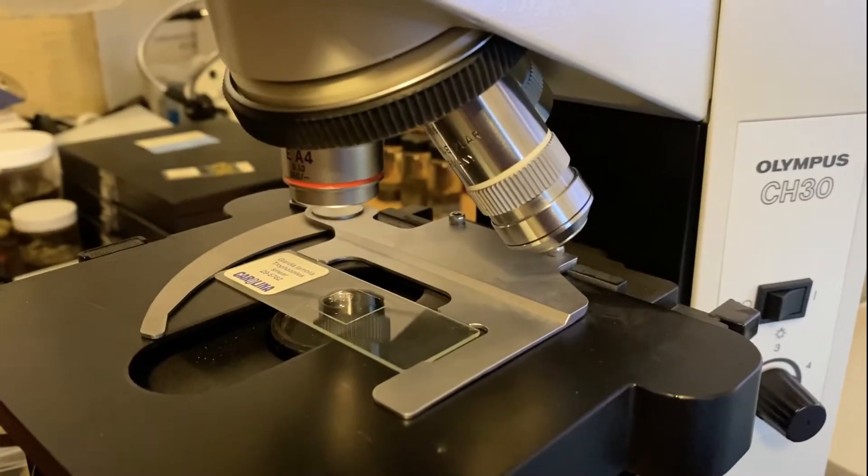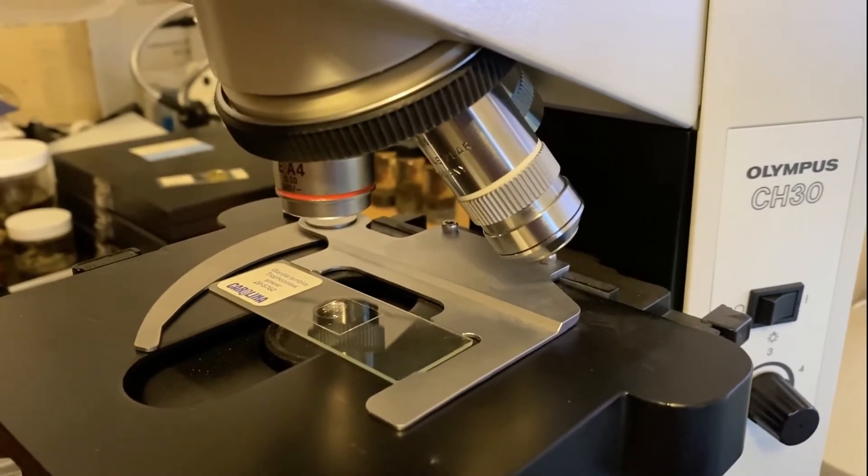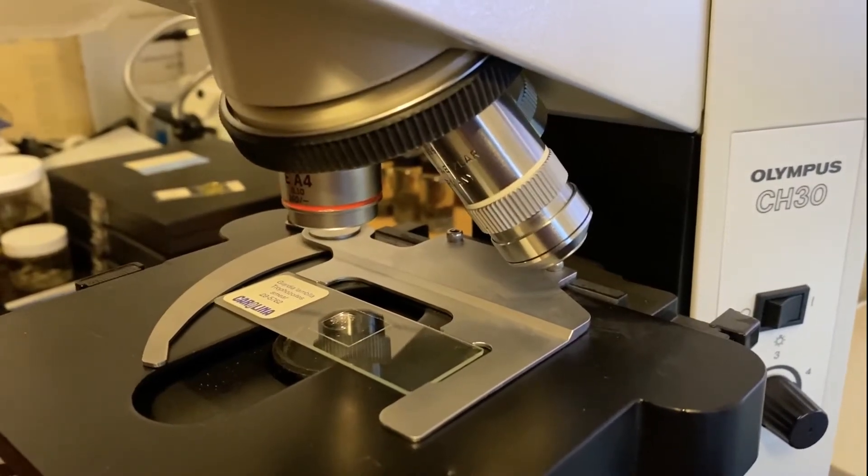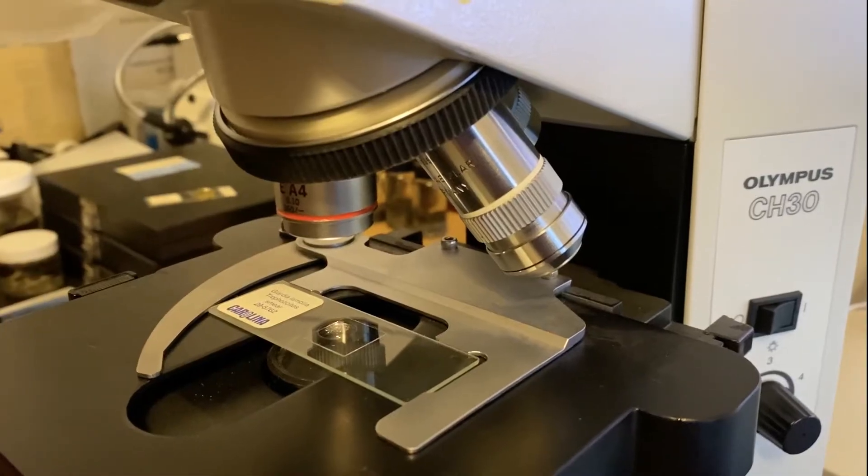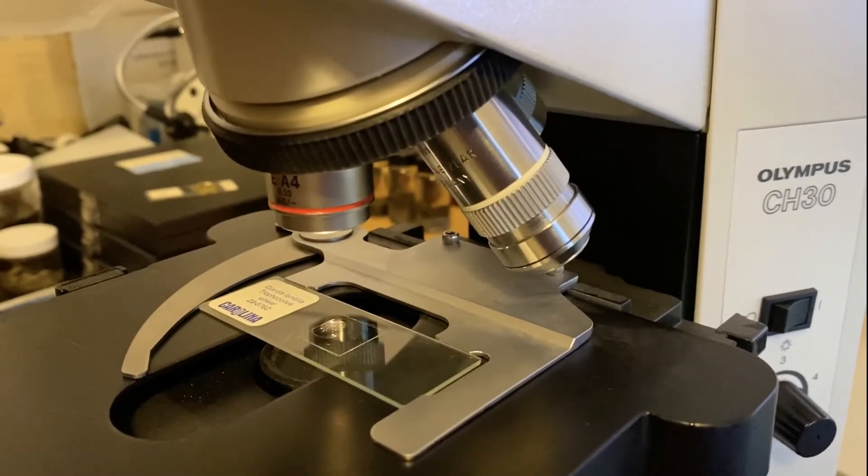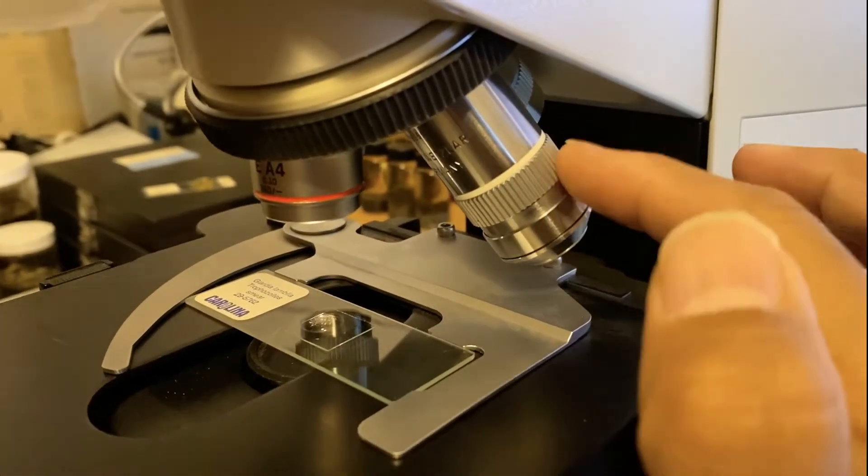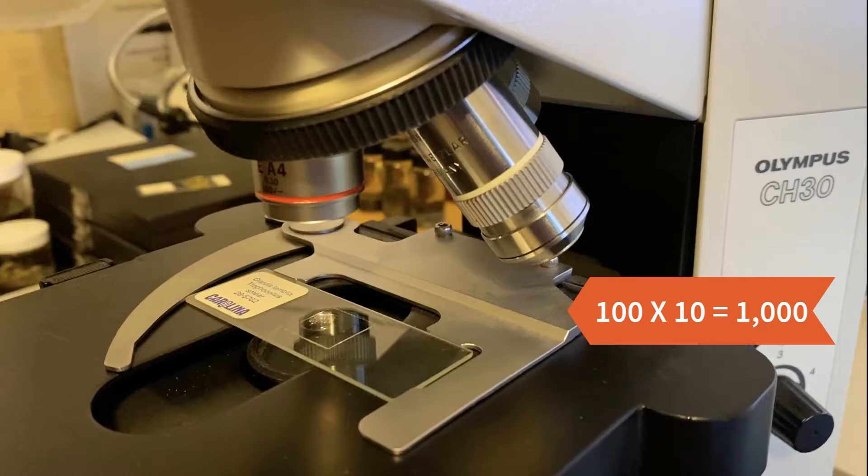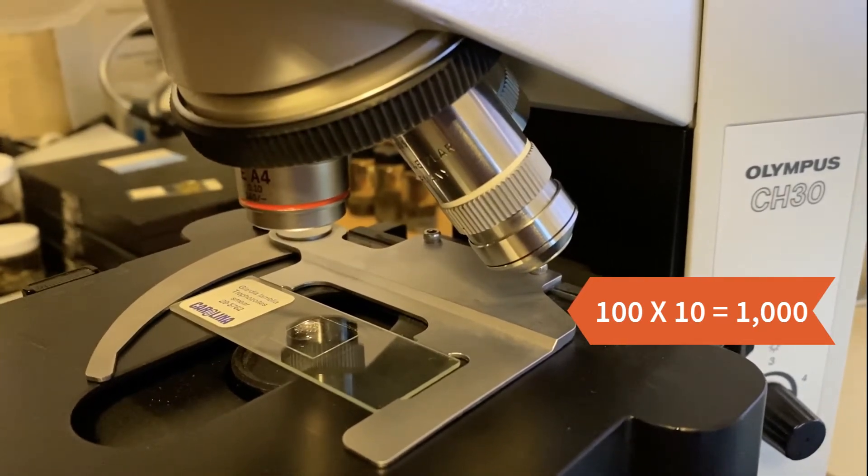In this video, I'm going to be showing you how to properly use oil immersion. I'm going to start with a slide that requires oil immersion. This is a slide of Giardia. Giardia is incredibly small, so you have to use the highest magnification here. The highest objective lens we have is this one right here that's 100 times magnification. When you add it to the eyepiece, which is 10 times magnification, that makes a 1000 times magnification image.